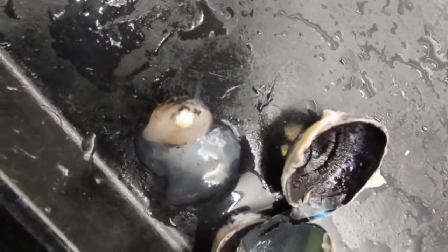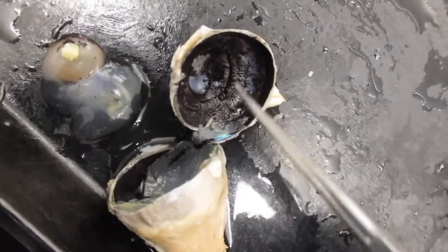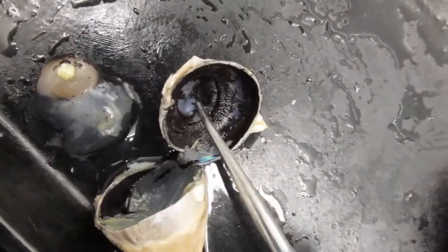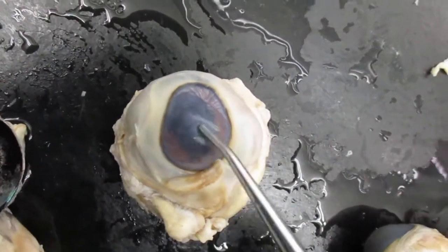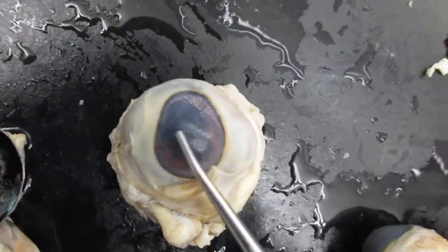So the lens is going to be connected right in here. It sits right in here, and there's some fluid right behind your cornea. So this right here would be your cornea. This surface right here, very clear, transparent. That's your cornea.